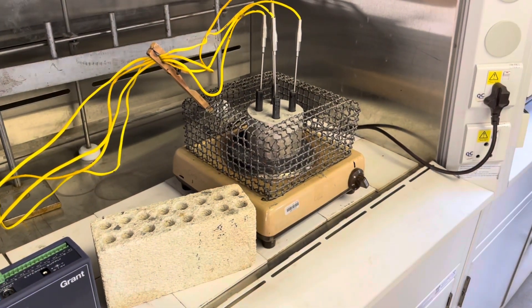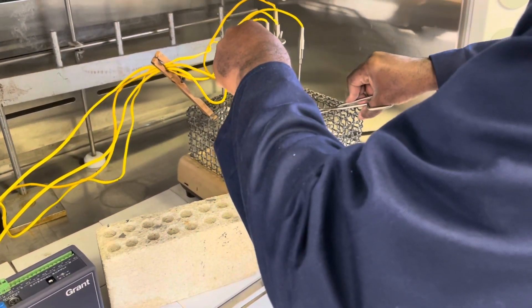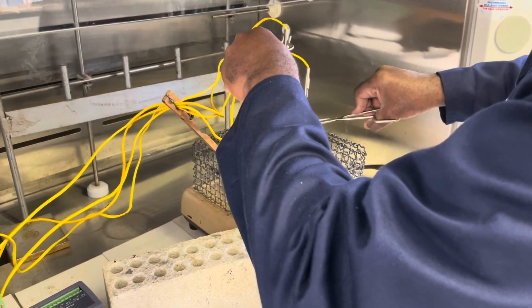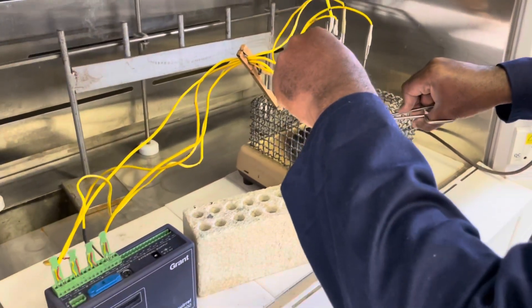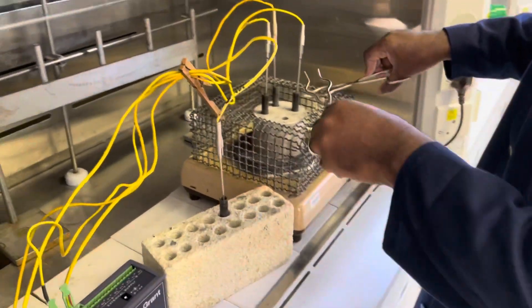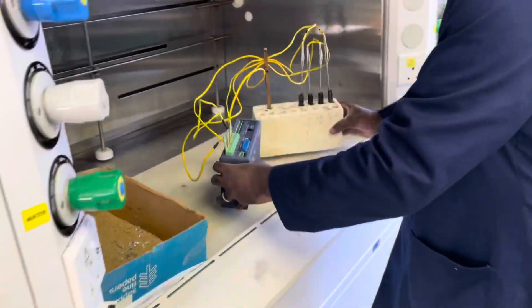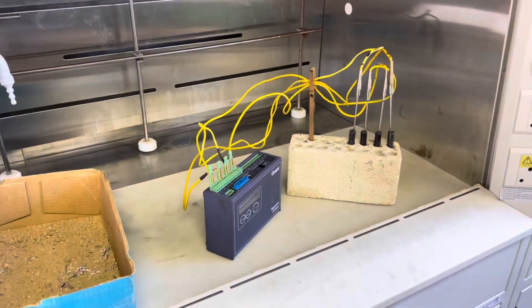Thereafter you will remove the steel test tubes from the heating source using tongs — be extremely careful since everything at this stage will be extremely hot. Place your steel test tubes in the cooling rack. You may move your data logger and cooling rack to a different fume hood to collect the data.